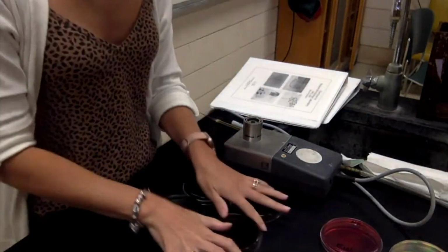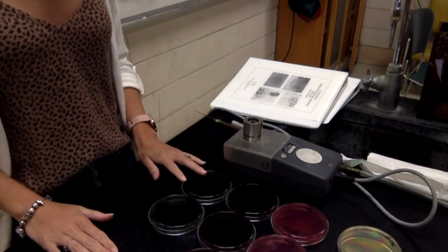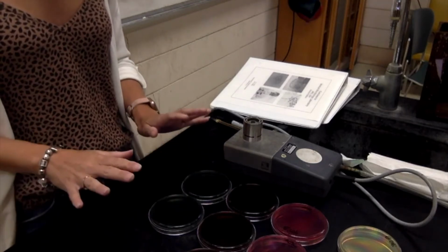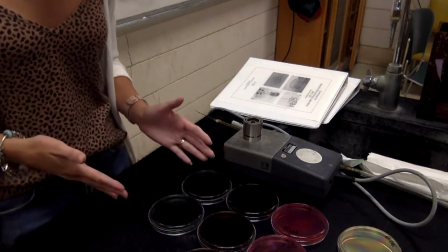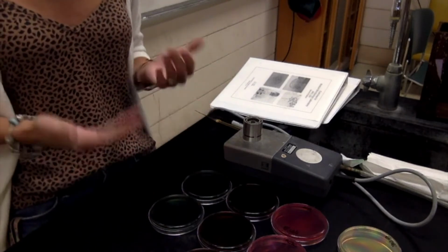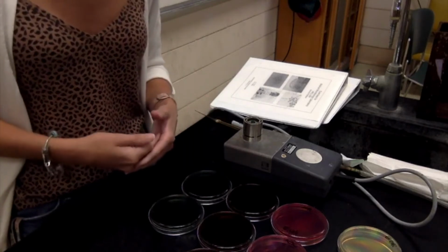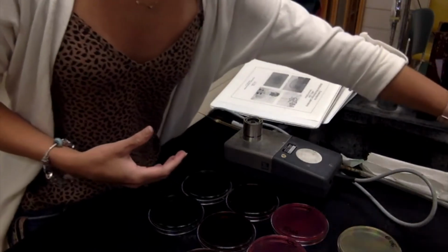I've already labeled all of them with, of course, the bacterial name and the type of media that they are. I don't usually have to label the media just because I know what it is, but if you were doing this in lab, you would need to make sure that you label what kind of media it is so you don't get confused.